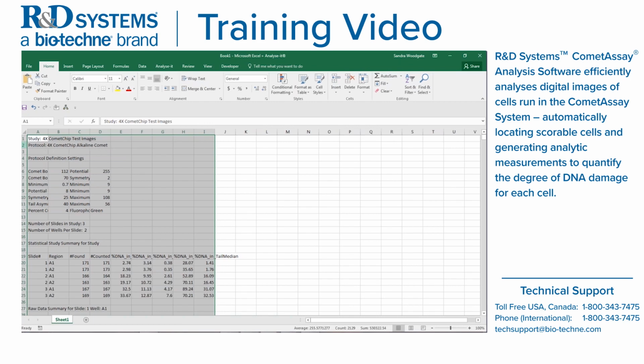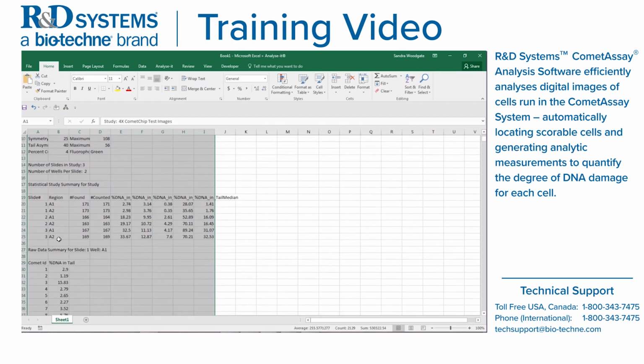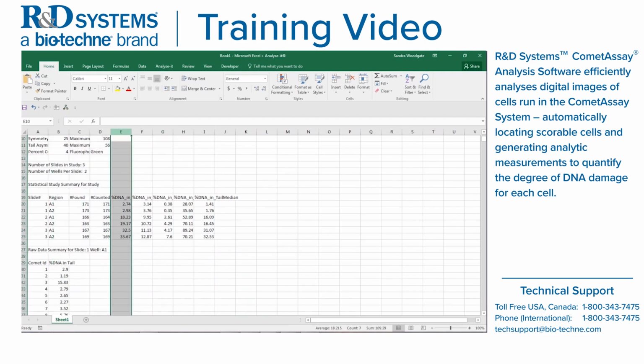It was named this way because the images I typically take with CometChip are 4X. These are the protocol definitions that were used to generate this protocol. We're going to discuss how to generate a new protocol later in the presentation. Again, we had 3 slides in our study, and we had 2 well slides. Following this is the summary statistics.